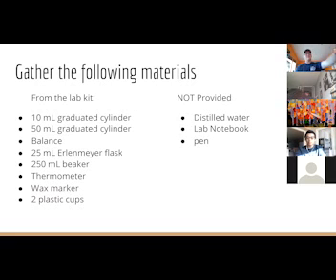But how could you tell the difference between them from across the room? You don't even need to be close to it. The flask has a different shape as well. Like the beaker, what's different about it? Unlike the beaker, its bottom half is wider to hold more volume. Yeah, exactly. The flask has a narrow top.